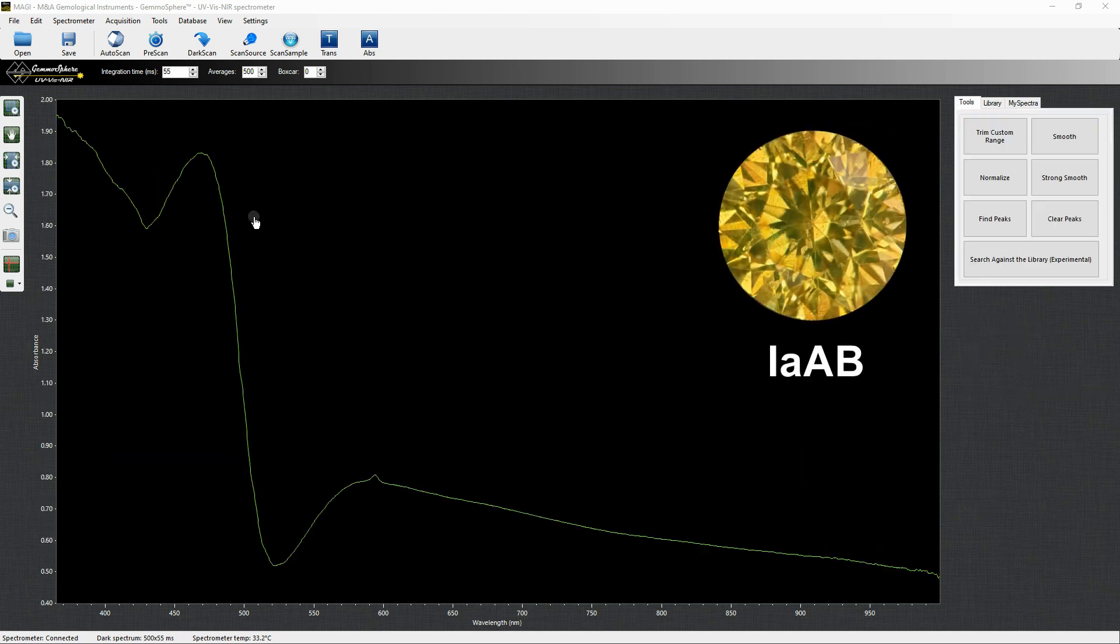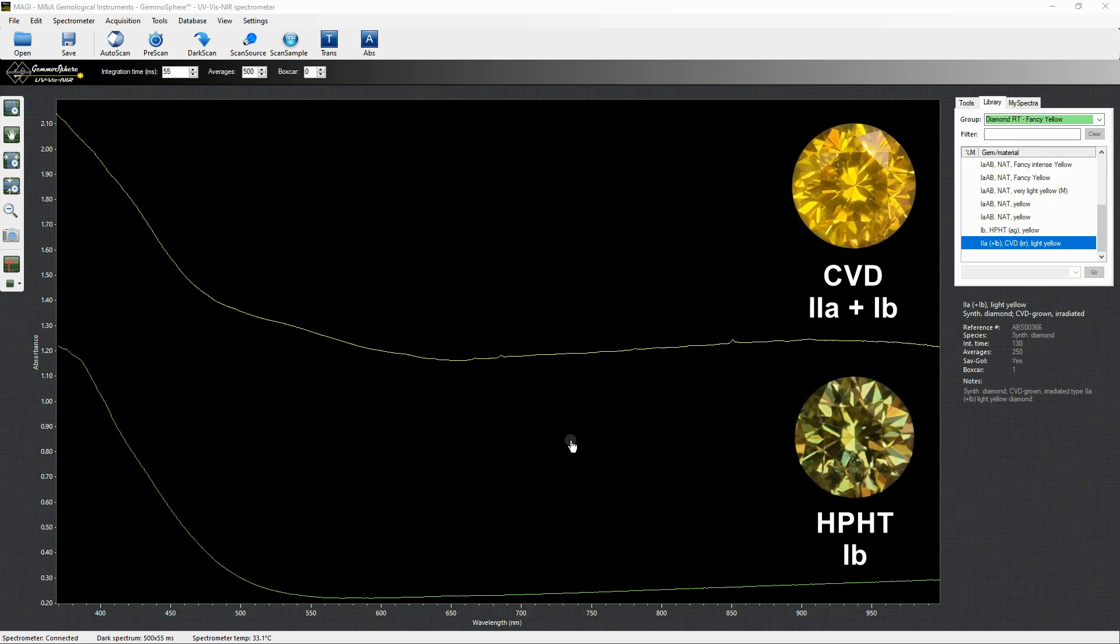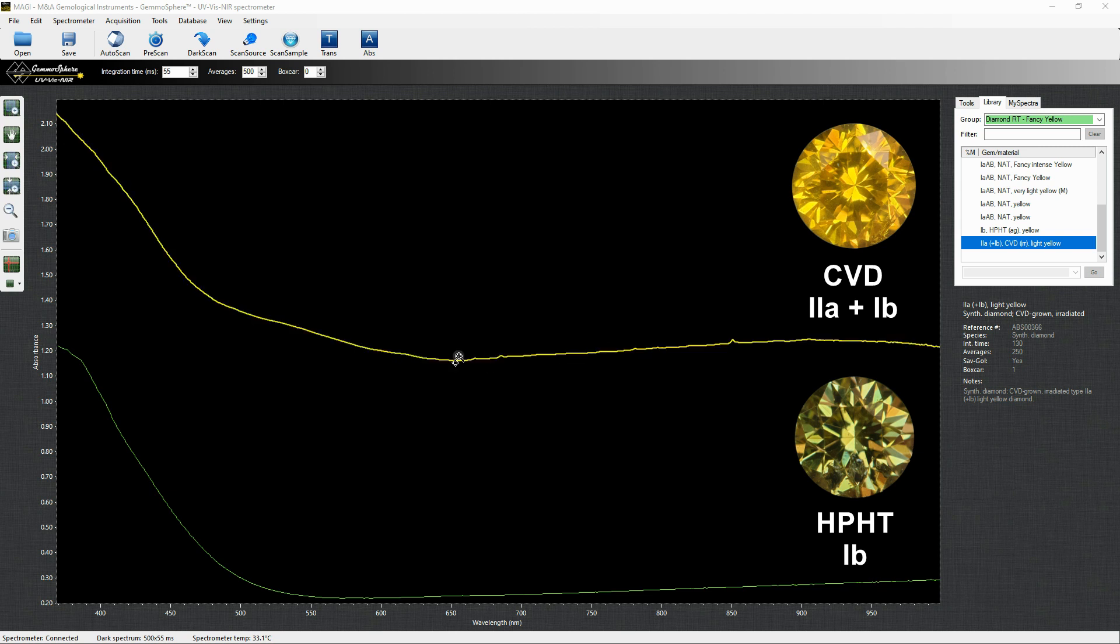This is the spectrum of an irradiated yellow diamond. Despite it can be very rarely present even in untreated diamonds, this peak at 595 nm is a good indicator of irradiation treatment. HPHT and CVD synthetic yellow diamonds feature the same single nitrogen continuum as the natural yellow 1b.